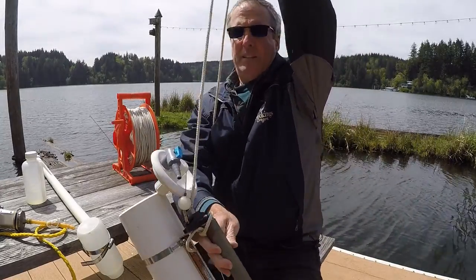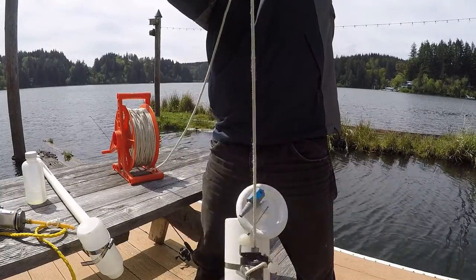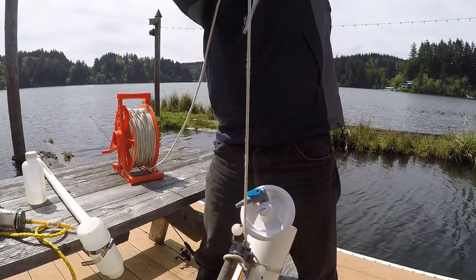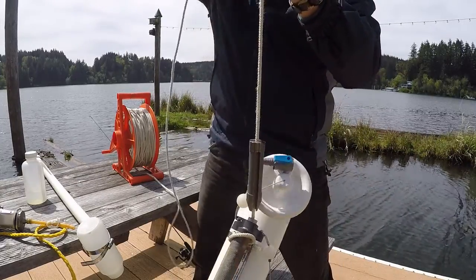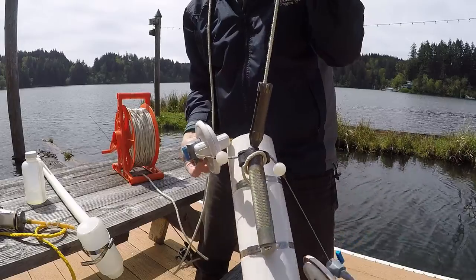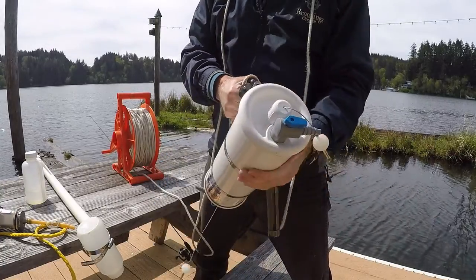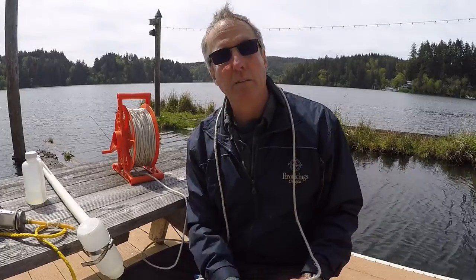and it'll be like this in the water column. And then what you do is you just slide the messenger down. So this little piece right here is now up in the boat, and you just let it go from the boat, and it slides all the way down the rope in the water. And as it does that, it hits this button, and if we were in a more regular situation, it would hit this with enough force, which is the good point, is that this actually should be off to the side so it doesn't interfere with it. So this goes down and hits that, and both of them close.